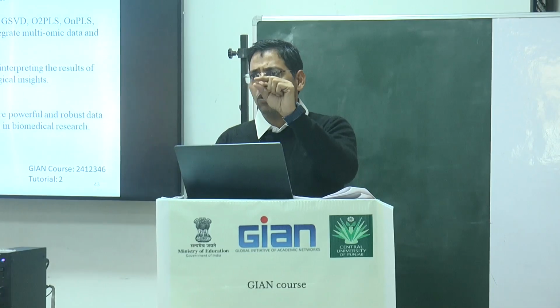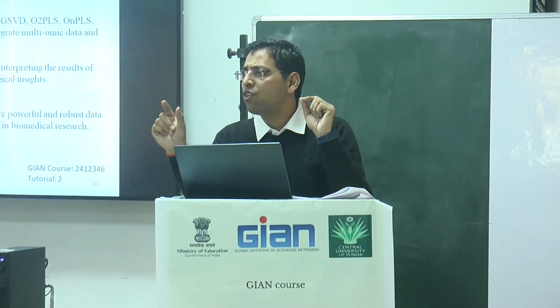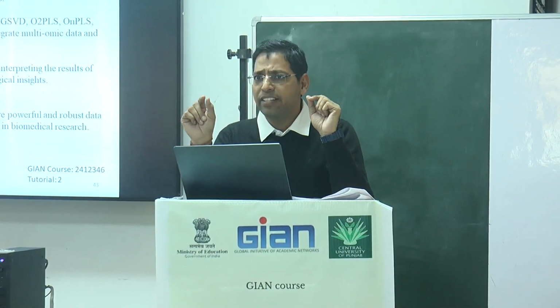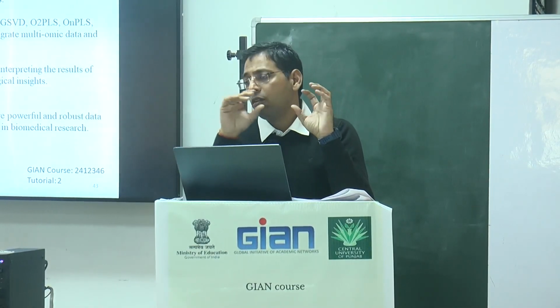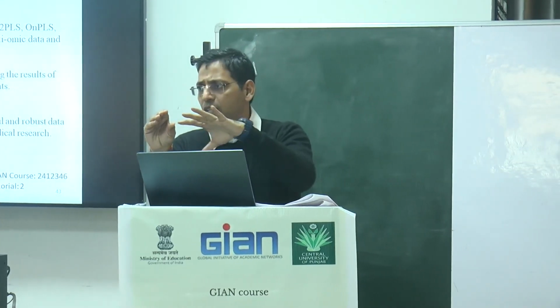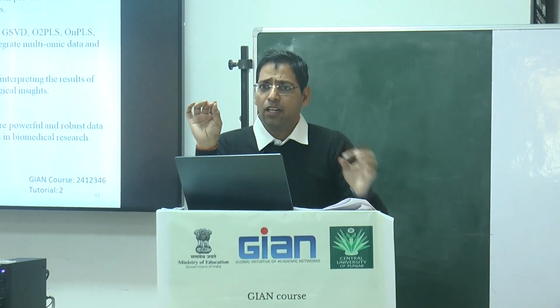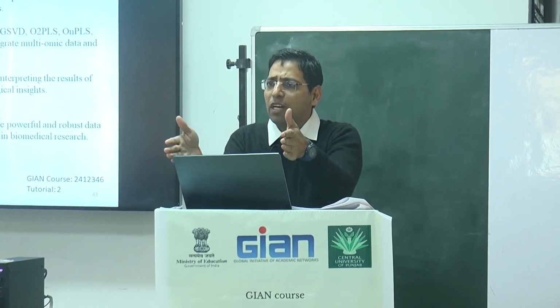So finally you will know a column. It has a standard size, it has uniform packing, and it has a diameter also. Now it was very difficult to put the sample, so they use the pressure. So that's why HPLC comes up. Now HPLC, you have the column, a very small column.